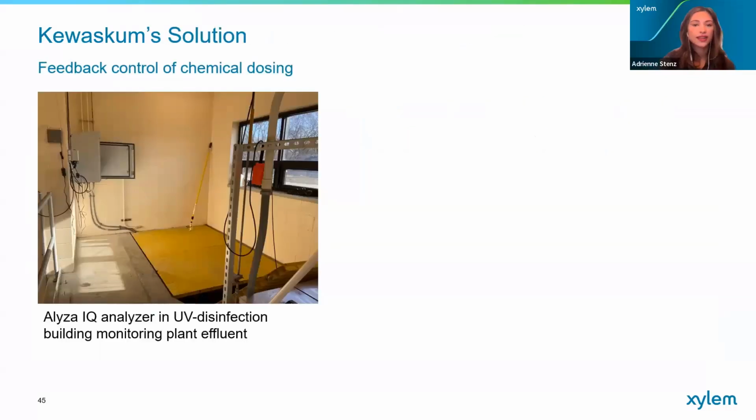And it's installed at the final effluent of the treatment process. When the analyzer was first installed, the laboratory tech did some upfront testing of orthophosphate and total phosphorus for about a month to compare it to the analyzer to confirm its accuracy, and both matched really well.